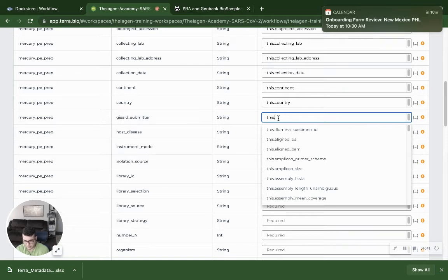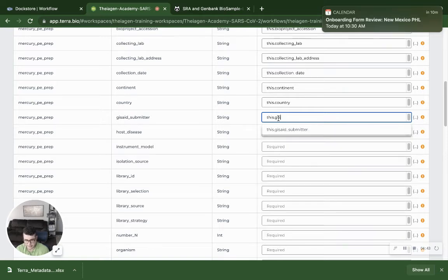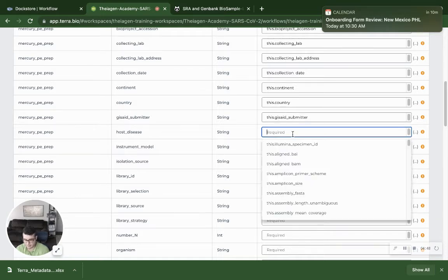You can see all of those, and you can see all of their references and the literature, both explaining and detailing these tools and citing these tools used in future analyses.